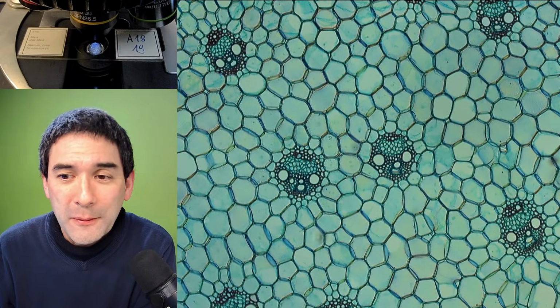Let me quickly explain what you're able to see here. Those round things are the so-called vascular bundles. These are the cells that carry water up the plant, and also nutrients like the glucose that was made down to the roots. So that's the cross-section of a stem, and in a typical monocot plant, you see that those vascular bundles are scattered throughout the stem.